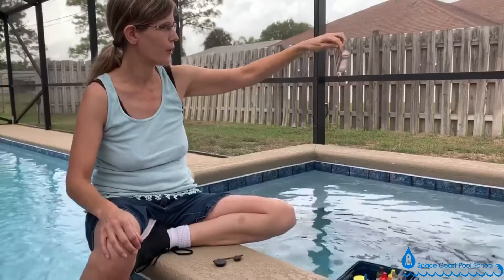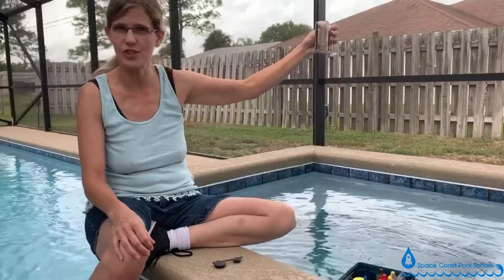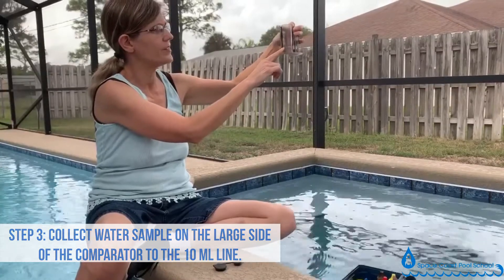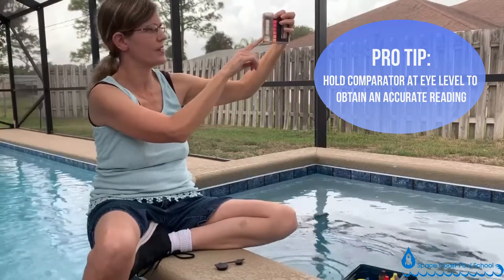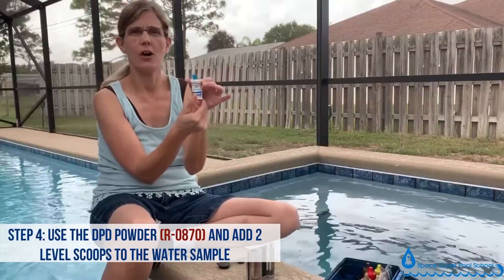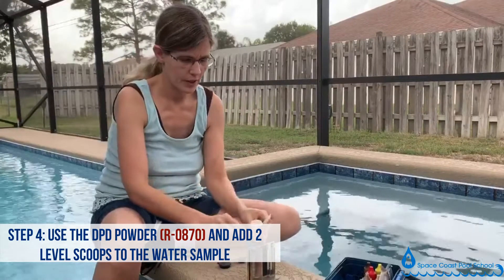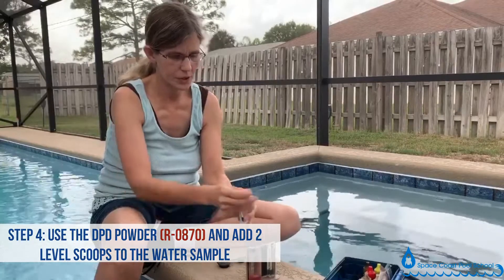I'm showing you the DPD powder test, which is a very accurate titration — a titrimetric test — for chlorine level. You collect your water sample on the large side of the comparator, drop the water level down to the 10ml line holding it eye level, making sure the curve of the water called the meniscus touches that line. Then take your powder R0870 in your scoop and add two level scoops into the water.